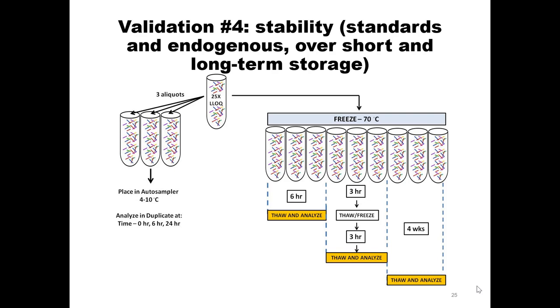So you get a set of plasma samples. Yeah, so ideally maybe you should have conducted the experiment when the subject's blood had been set at room temperature for 6 hours, then frozen, then the plasma was extracted, right? Rather than on plasma. So can you do this experiment especially from plasma? Does that make sense? Oh, you certainly could.